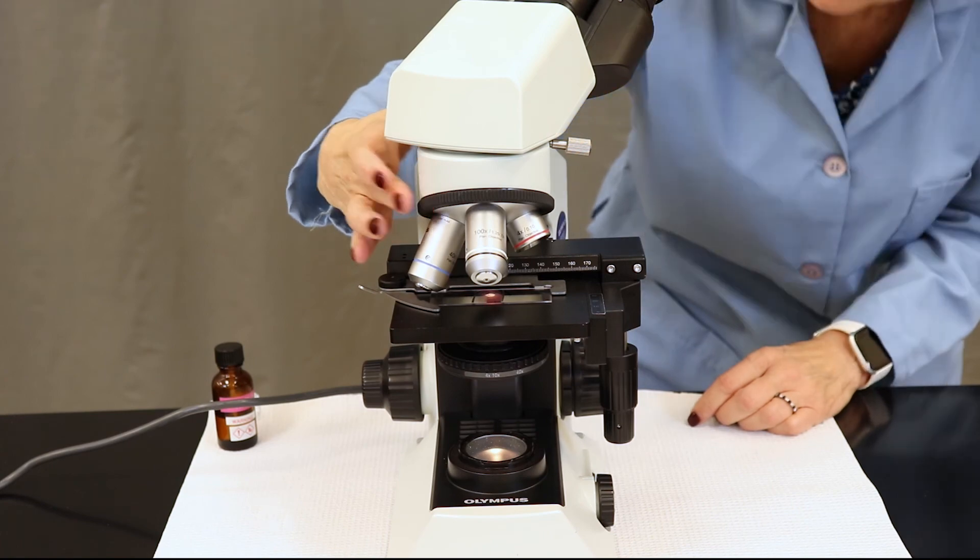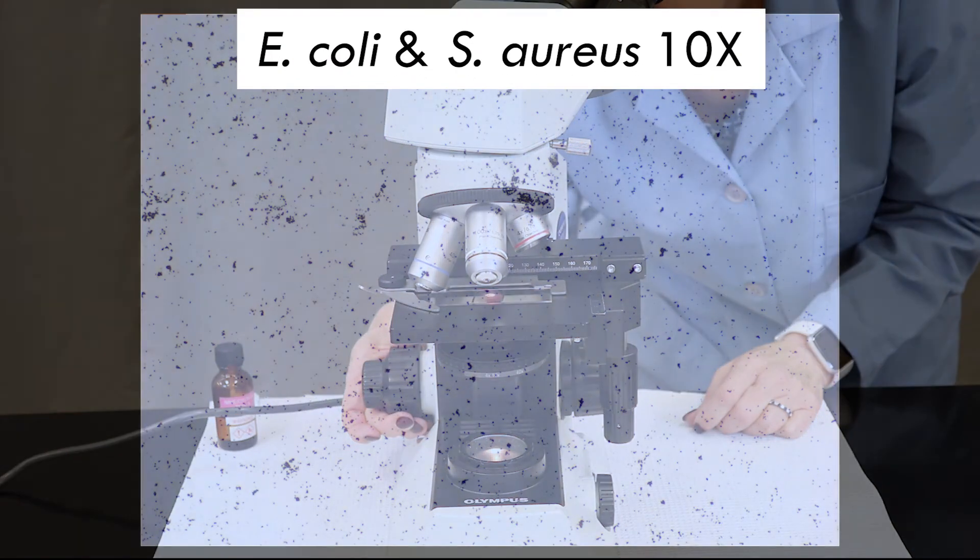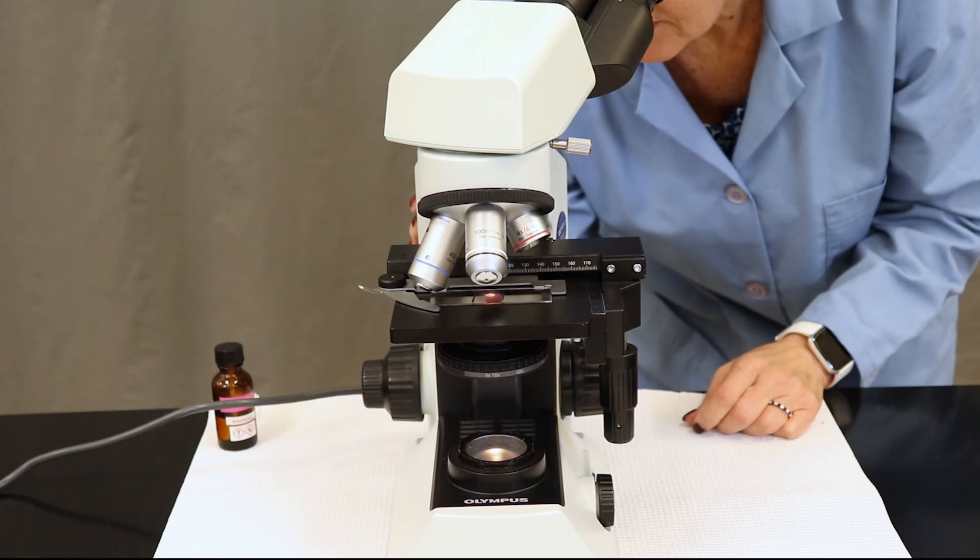Use the nose piece to place 10x in position. Since this is a par focal microscope, there's minimal adjustments that we need to do with the coarse adjustment knob, but adjust as necessary.